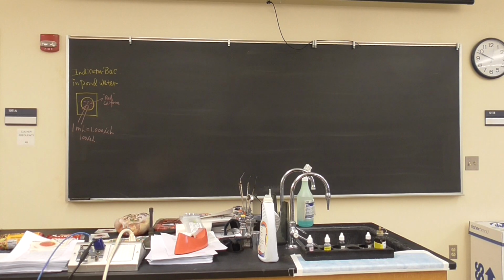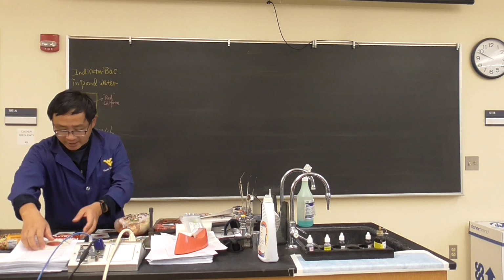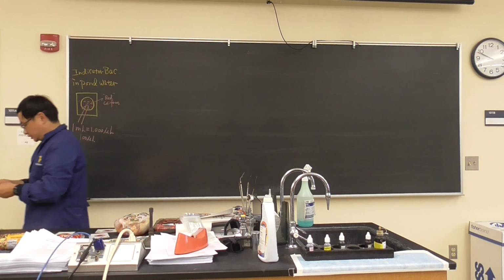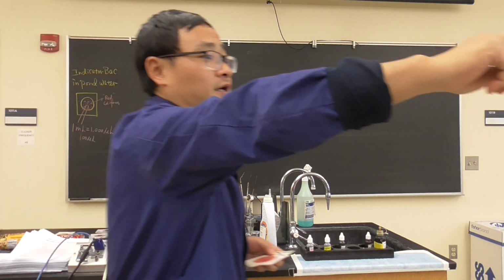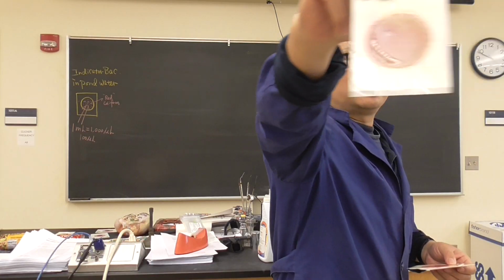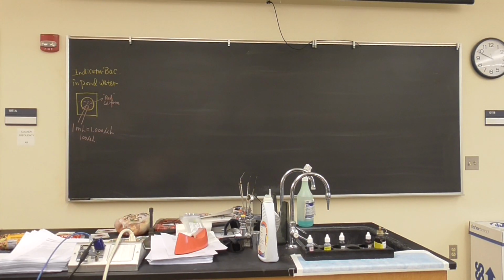Although the volume is incorrect, it looks good. Yeah. So I will be returning these back. So number 32, who is number 32? She did a really good job. Yes, you can see the E. coli there, and the coliform are completely different, and you can see a lot of coliform.